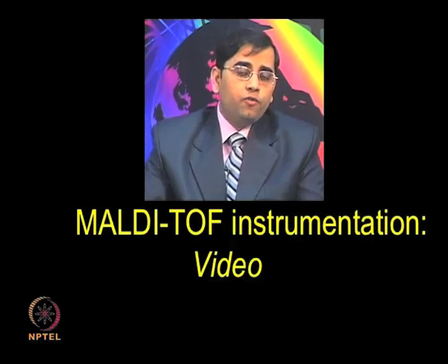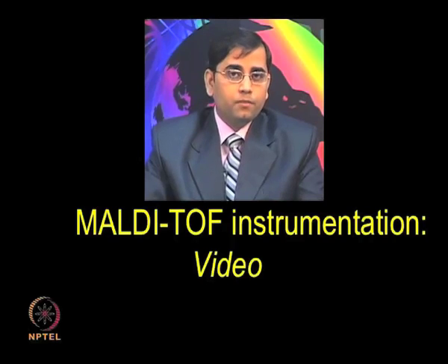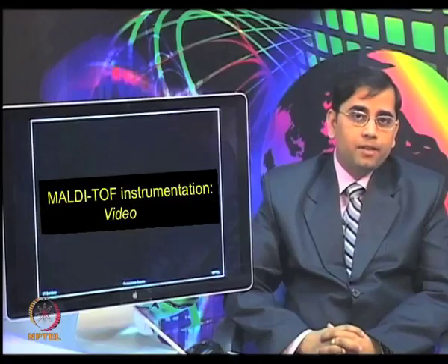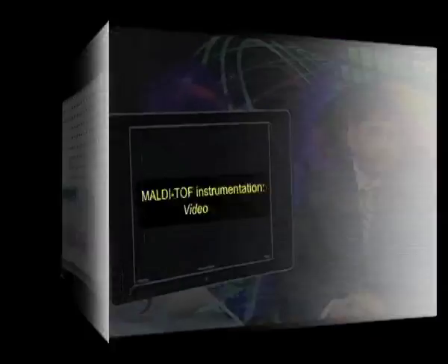Now, there are various types of configurations of these instruments available, as well as various types of commercial software which help to operate the hardware. It is not possible to go into individual detail, but I am going to show you the generic steps in the following video of MALDI TOF instrumentation.